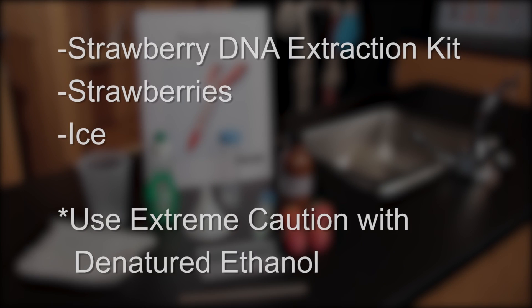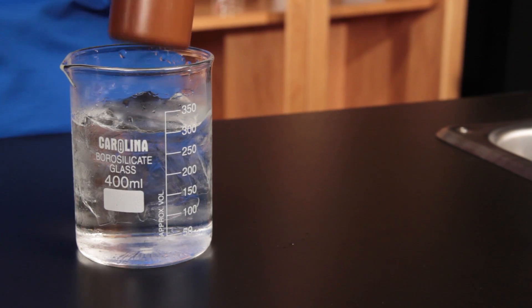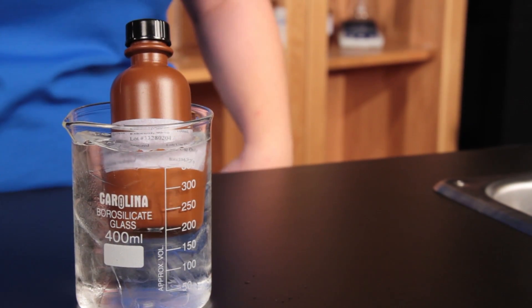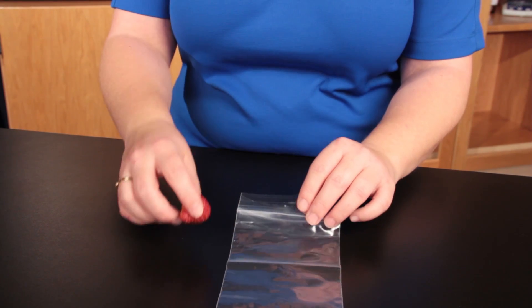For the strawberry DNA extraction, you'll need the strawberry DNA extraction kit, strawberries, and ice. Also remember that ethanol is denatured and doubly dangerous, so follow basic lab safety rules. First, place the ethanol in ice to chill it.